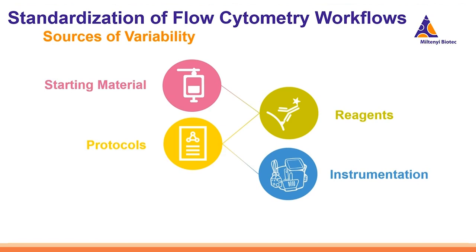Instrumentation. Flow panels are specific to the flow cytometer's optical bench, so you can't really just transfer flow assays between different optical configurations without some considerations. So if you do have the same optical bench, how can you harmonize a flow assay between different flow cytometers as you scale up? So there are some variabilities in instrumentation that we will discuss as well.